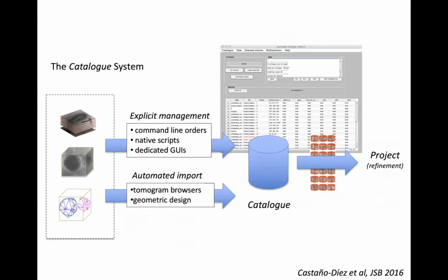So in our second module for tomography, what we present is this catalog system, which is kind of a database that takes for the user most of the effort of designing a rational way of organizing your data.